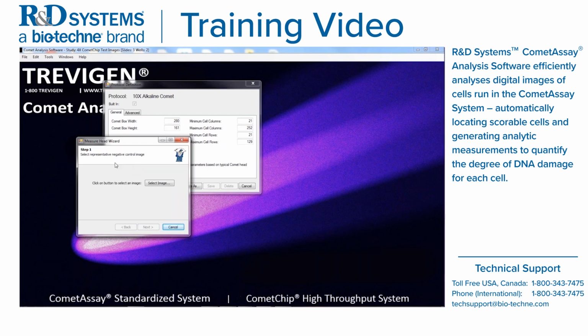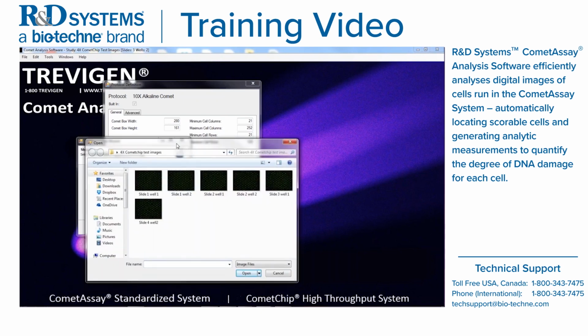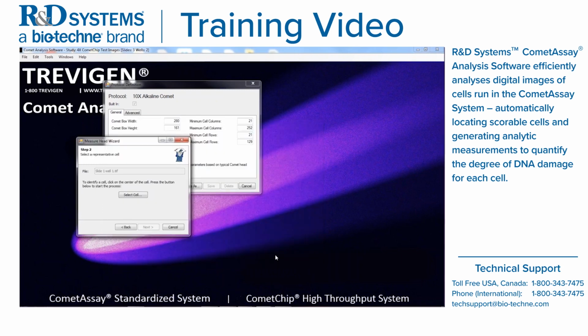Then what you need to do, step 1, select a representative negative control image. So click on the button to select an image. So let's select an image. I know that my first slide, slide 1, is my control. So let's select, open the image. Now step 2, to identify a cell, click on the center of the cell, press the button below to start the process. Okay, so hit select cell.